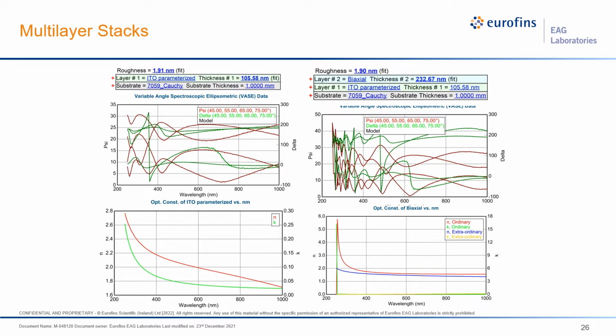We see that the PEDOT layer not only exhibits absorption in this wavelength range, K is different from 0, but also is birefringent, as we have seen earlier in the example of the polyamide layer on the substrate.